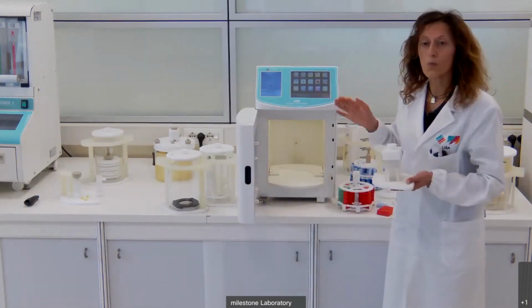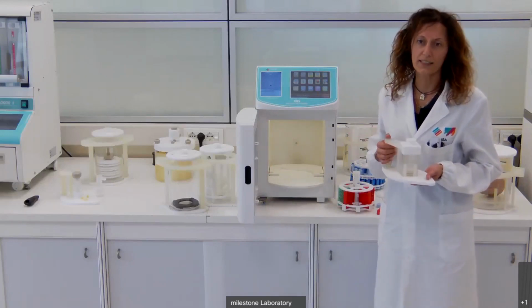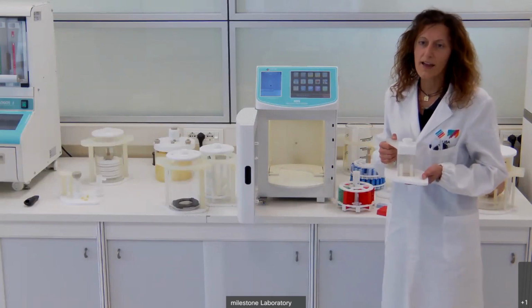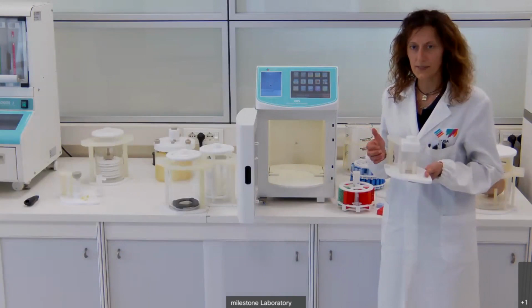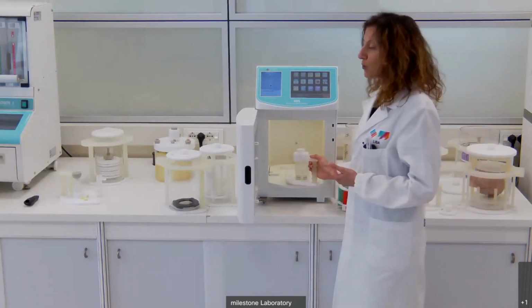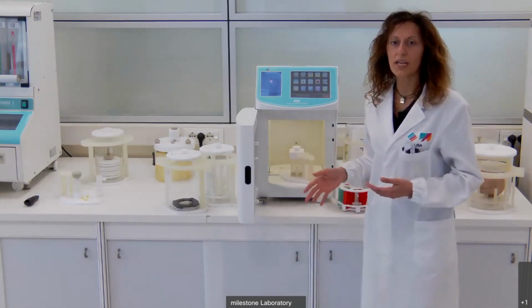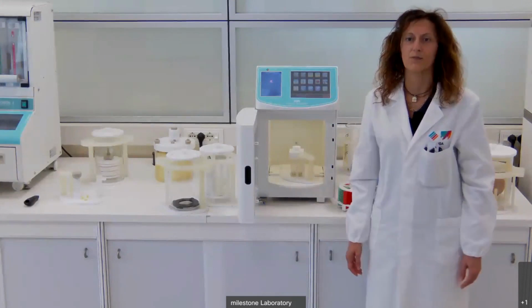And on board, we have a preset protocol for the different kind of special stain. And these protocols are very fast because some steps of each protocol are performed with microwave irradiation. In this way, we can reduce the time of the special stain.